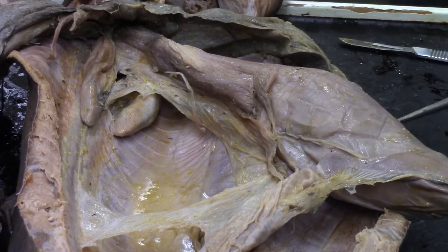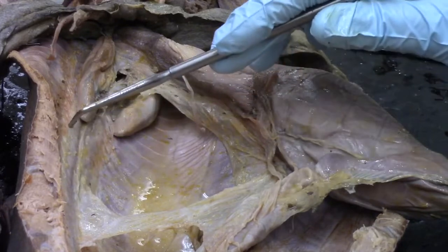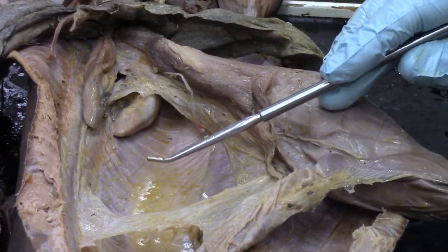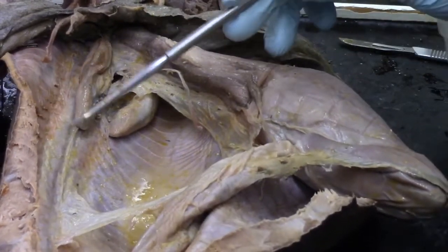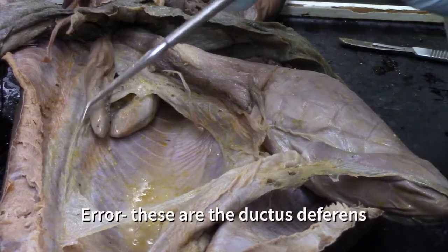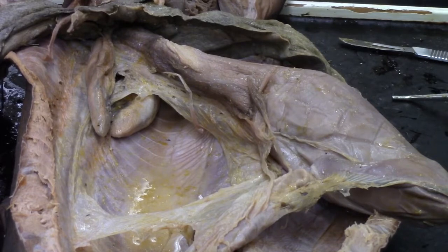It may be a little difficult to tell the orientation of the shark right now, just because of how I've cut it. But this line running down here is our center line of the animal. And on either side of that center line, we will have the kidneys running basically the entire length of the body cavity. When you see this up close, I'm not sure if you can see it on the video, it might be rather difficult, but overlying the kidney there are small wiggling tubes, and those are going to be the seminal vesicles. So they actually lie over top of the kidney. This is our basic male shark anatomy. We can come back in just a moment and we'll see how the female shark looks a little bit different.